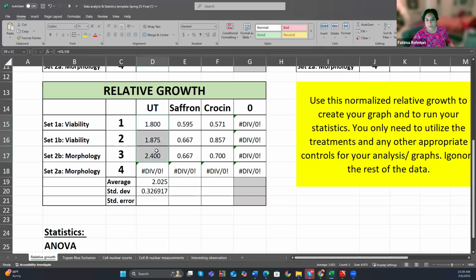So you're selecting the numbers that you have in untreated for the first one. And now, all of our numbers in this case have the same n number. But again, imagine a situation where your different conditions have different n numbers. Maybe for one particular treatment, you have n equals 10. Another one, you only have n equals 4.